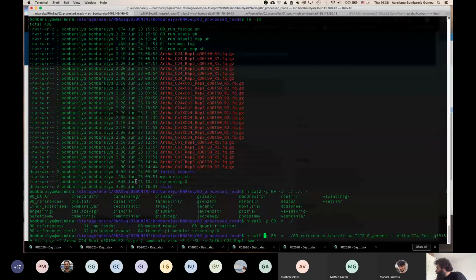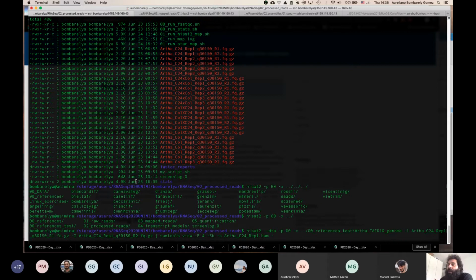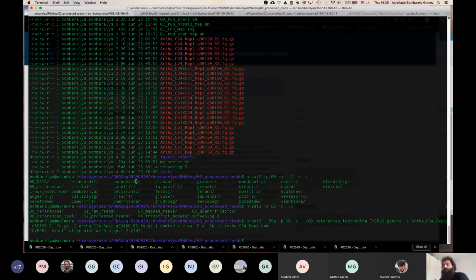So as I said, yeah. Now we need DTA. I'm not sure about the one that you said you're making wrong. Check the output. Maybe the output is right. As I said, this maybe was an old version of some tools, and in the new version they corrected it. As I said, I don't know. But anyway, I'm running the command already. Sorry, I'm going to stop it first.